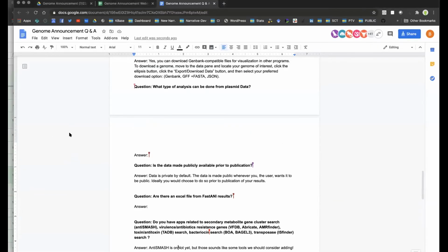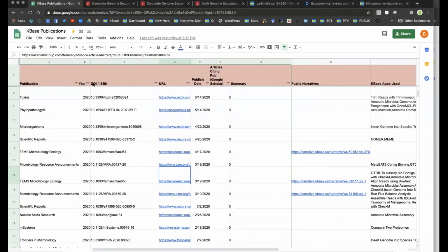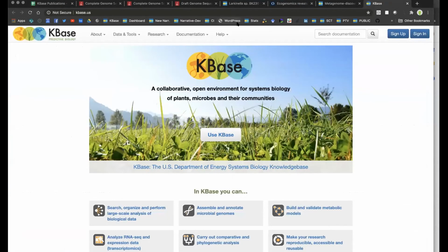So what I just wanted to talk about now is some of the publishing and sharing side of using KBase, and this is something that we think makes our platform different, and I think there's a good case to be made for that. I'm going to show you more about in a second.